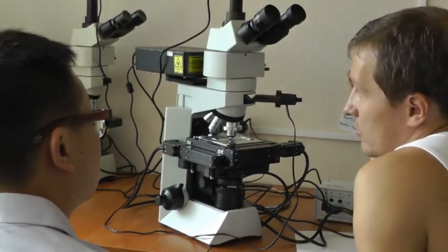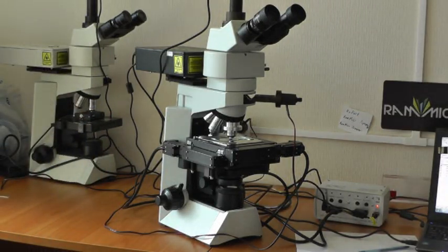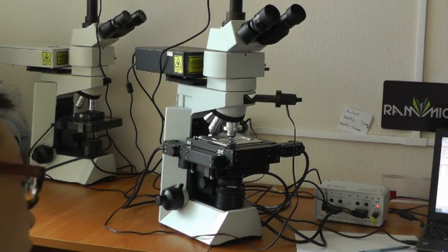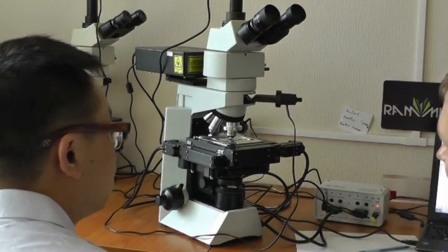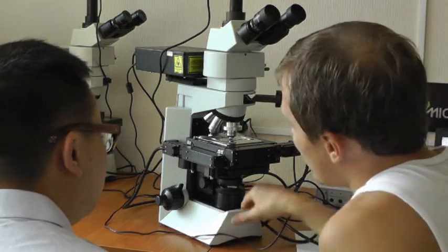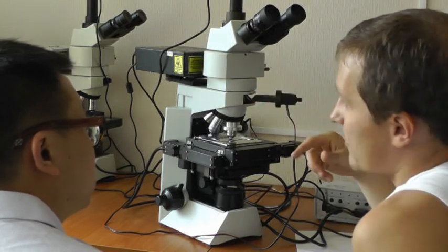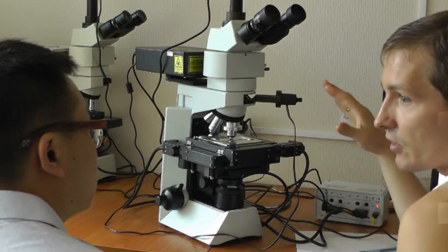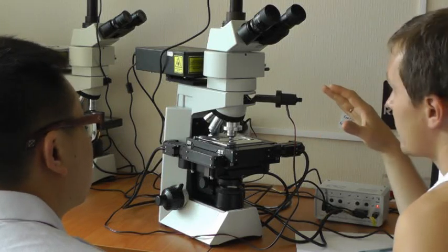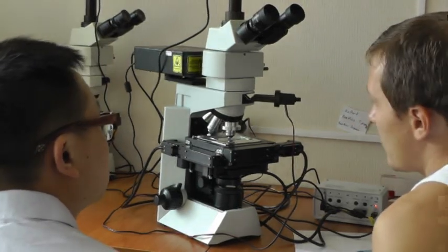It is very cheap, and the difference is only in the diameters of flanges for the different microscopes, to secure the Raman module on the microscope. So anyone, Nikon, Olympus, anyone.